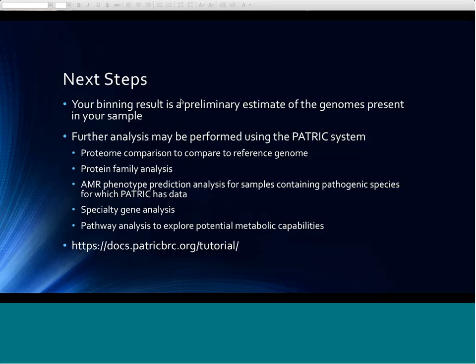Yeah, that's sort of out of scope of the current goals of PATRIC, but goals change. So I think one thing to remember, or at least the motivation for us putting in the host genomes that we did, was in response to host response analysis. And usually the host that, since this is funded by NIH, the host they care the most about is human, and so we used human and model organisms for representation of hosts.